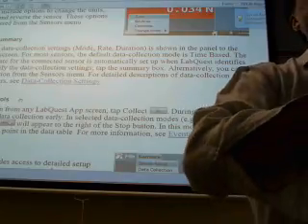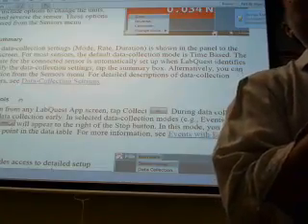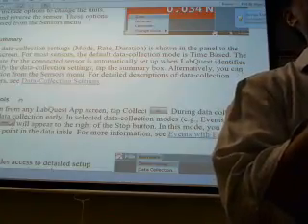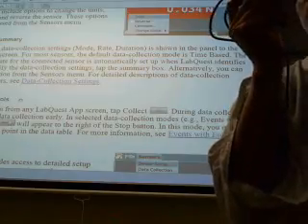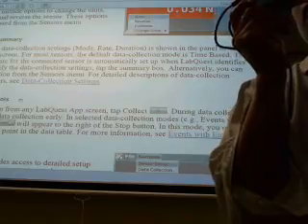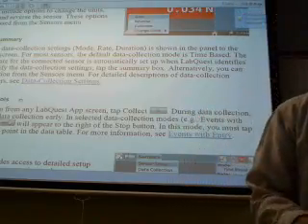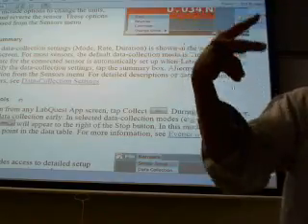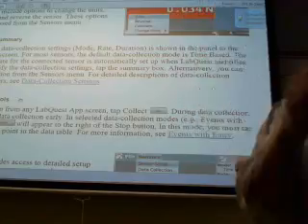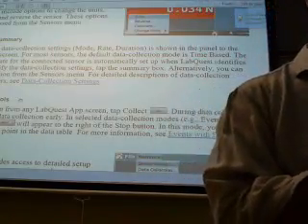Yeah. You see, if you collect maybe one sample per second and go 10 seconds, you'll get 10 data points, and then it graphs it. Do you see that? So every 60 seconds you would count them. So once you hit 1 minute, then we're actually going to record those ones. Yeah, you have to wait for 1 minute to see the first data point, which is an eternity right now.